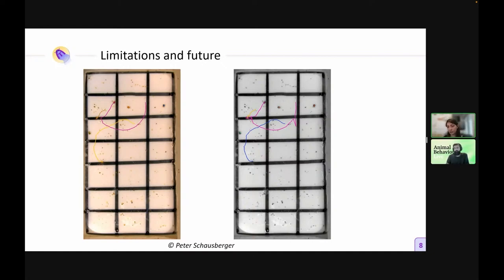But I'm a bit waiting because as the program is quite new, for the moment we have only two citations, which is quite normal because the program was released 1 year ago. But I'd like to see how useful it is to people. If I really have the feeling that people are using the program, that it's useful, then I believe I will begin to invest more time and maybe try to get grants or more funding to work on that and to begin to build a team, not be me in my room doing that.